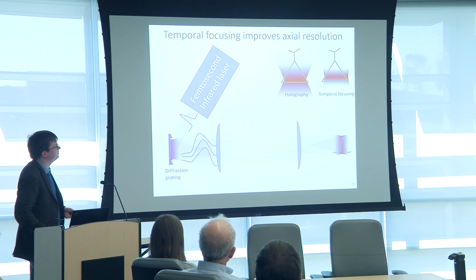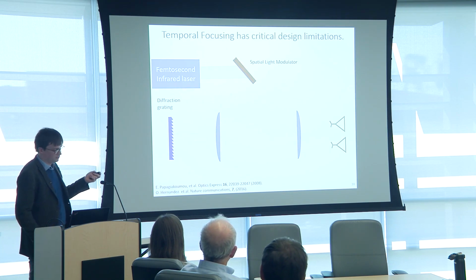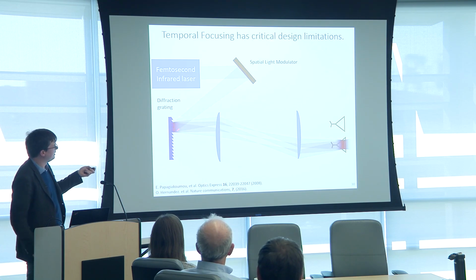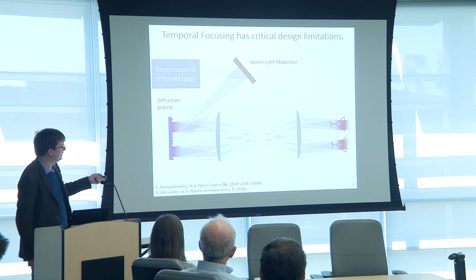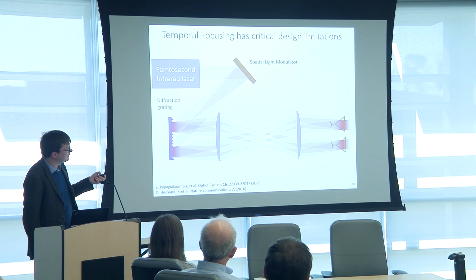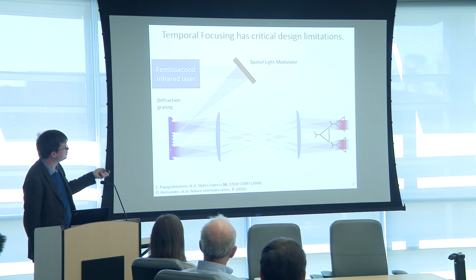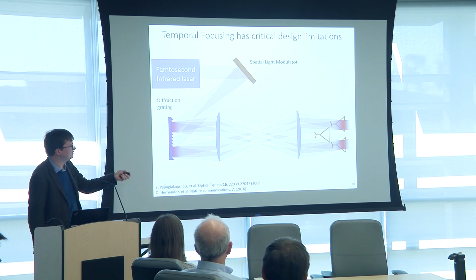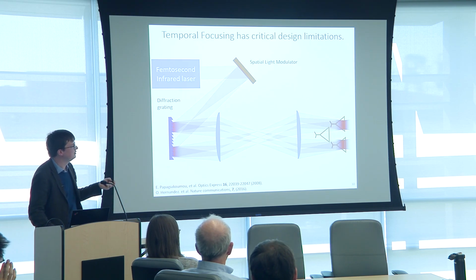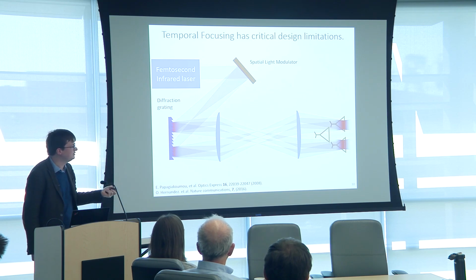So how do we turn this into a device that can target multiple neurons at once? Well, we use an SLM. And with an SLM, we shoot at the diffraction grating, and we make, for instance, 2 targets. And each of those targets will be creating 2 images into the optical system targeting different neurons. So you basically draw what you need on the diffraction grating. And you can see here what the issue of this technique is: the temporal focusing happens at the image plane of a diffraction grating, which means anywhere here. But since your brain is three-dimensional, it doesn't happen above or below. So that technique has excellent temporal resolution, excellent spatial resolution, but unfortunately doesn't work in 3D.